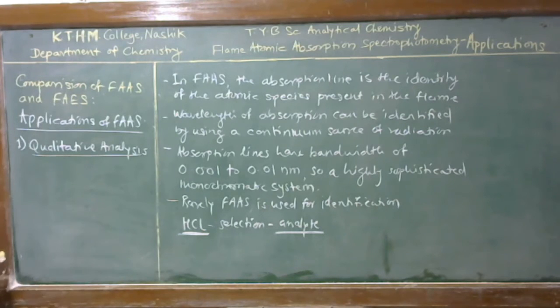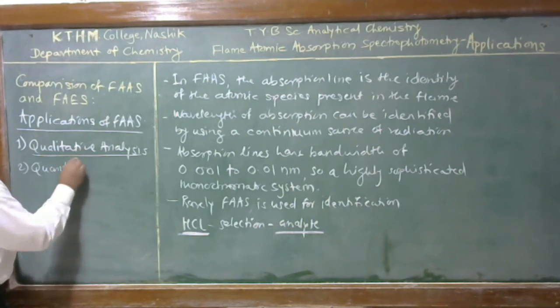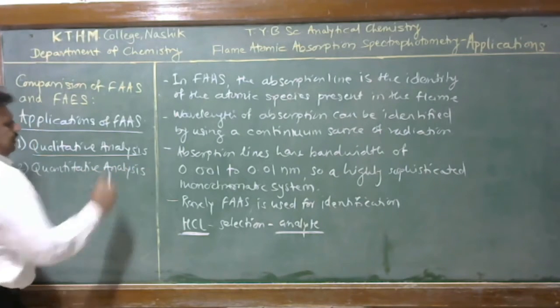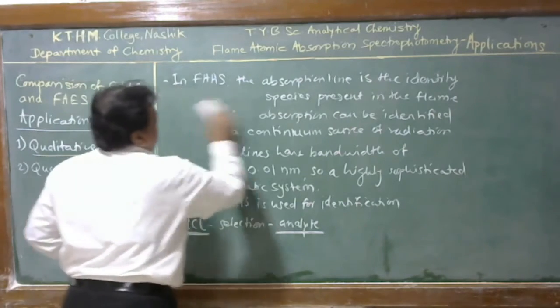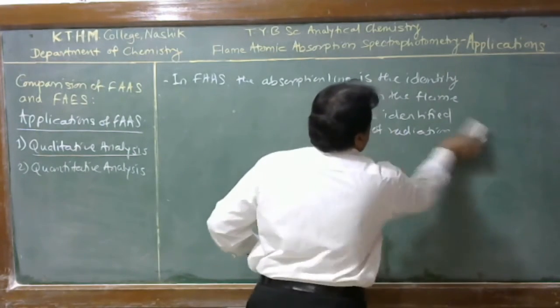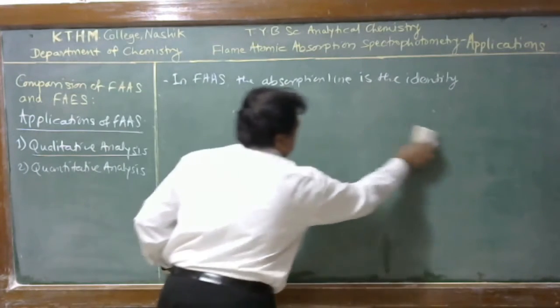Now we discuss the quantitative applications. Quantitative analysis: in flame atomic absorption spectrophotometry, the absorbance of an absorption line is measured for determination of the analyte.